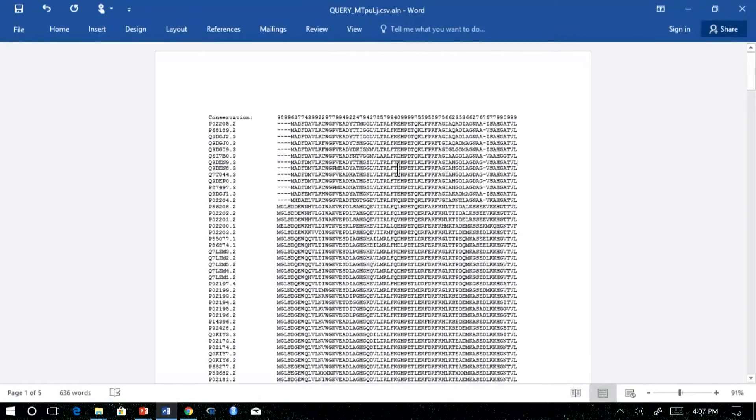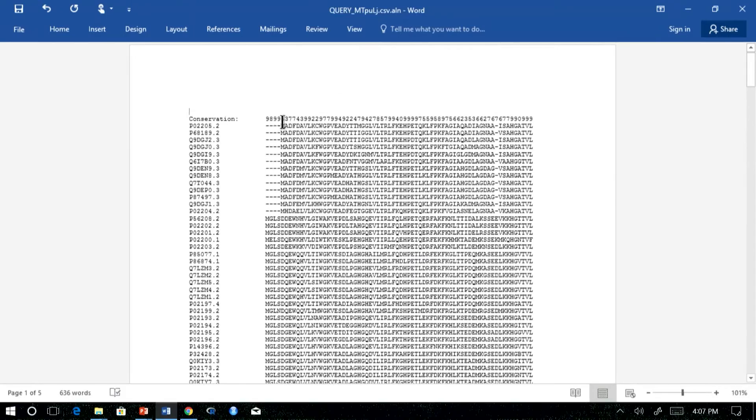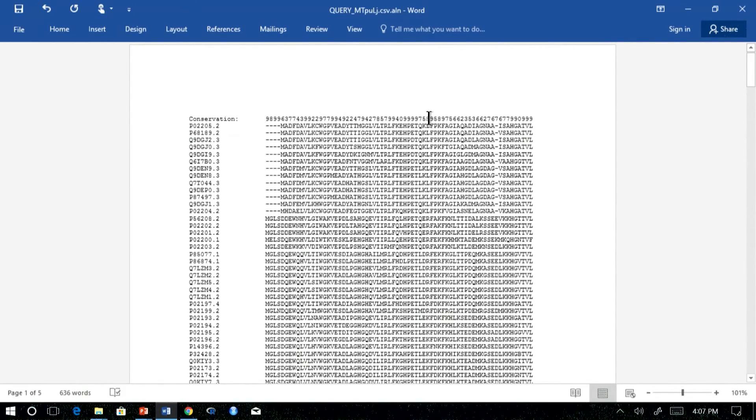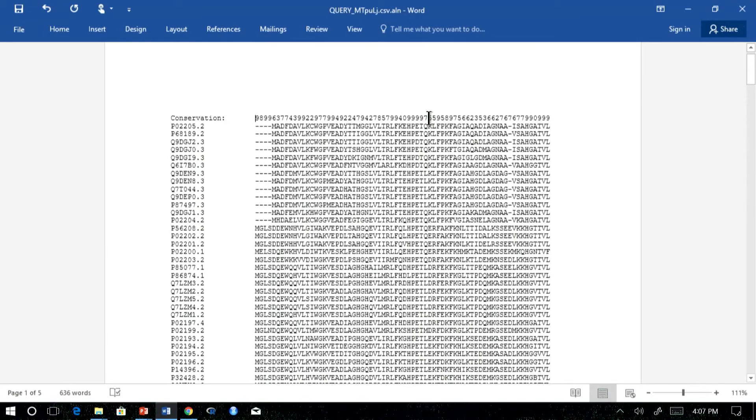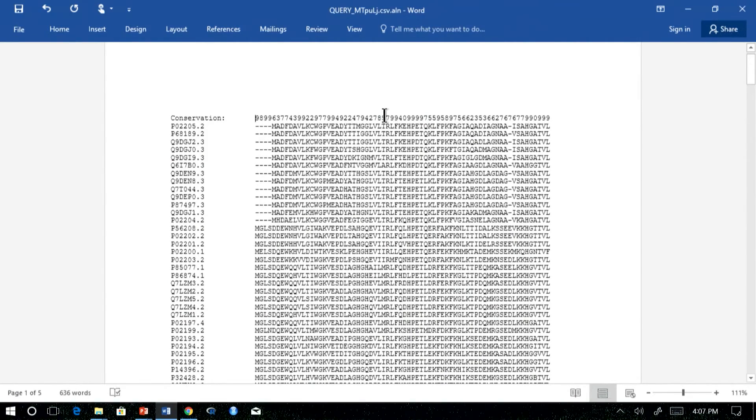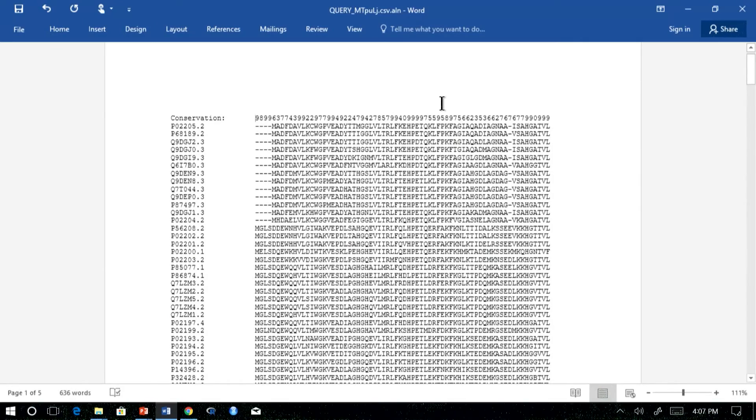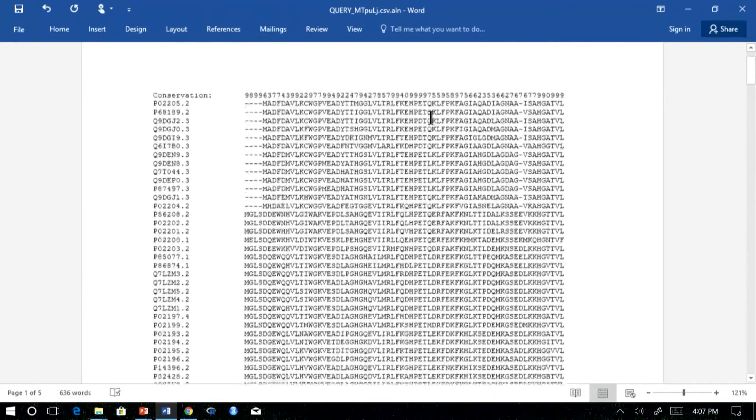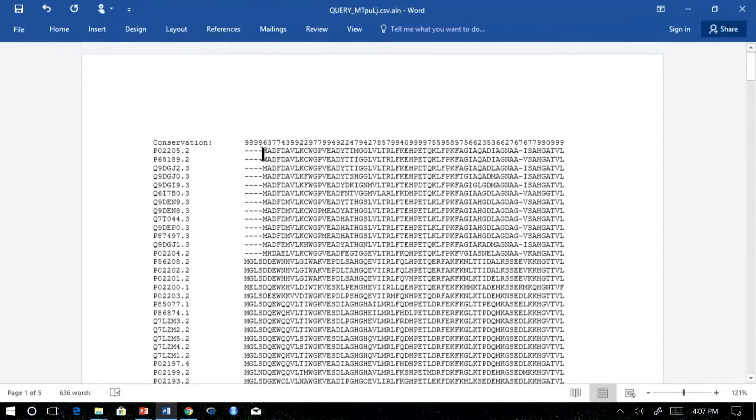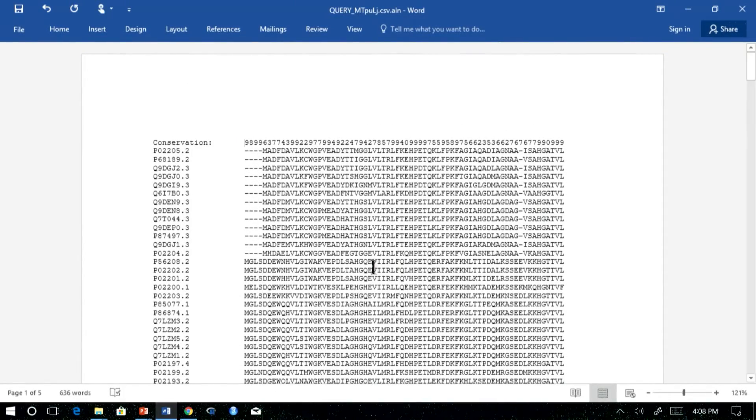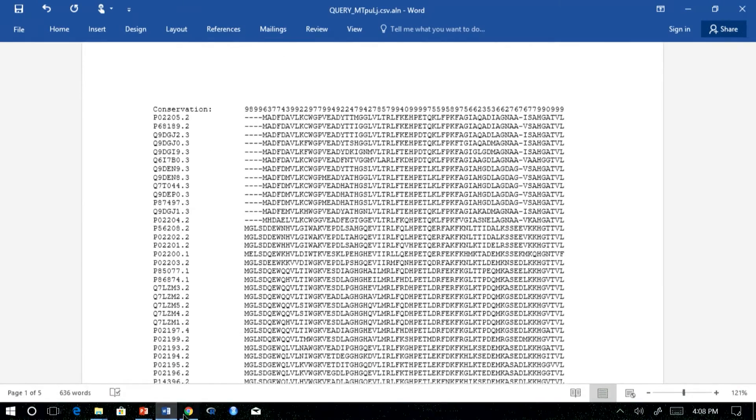So the second output contains the alignment itself along with the conservation score. The score here is not what we computed. It is an integer from 0 to 9. So 9 is very well conserved region, whereas 0 represents the variable region. This can be directly interpreted unlike the score values which you obtain in the first output. For example, let us compare the UniProt information with the corresponding conservation value we got here.